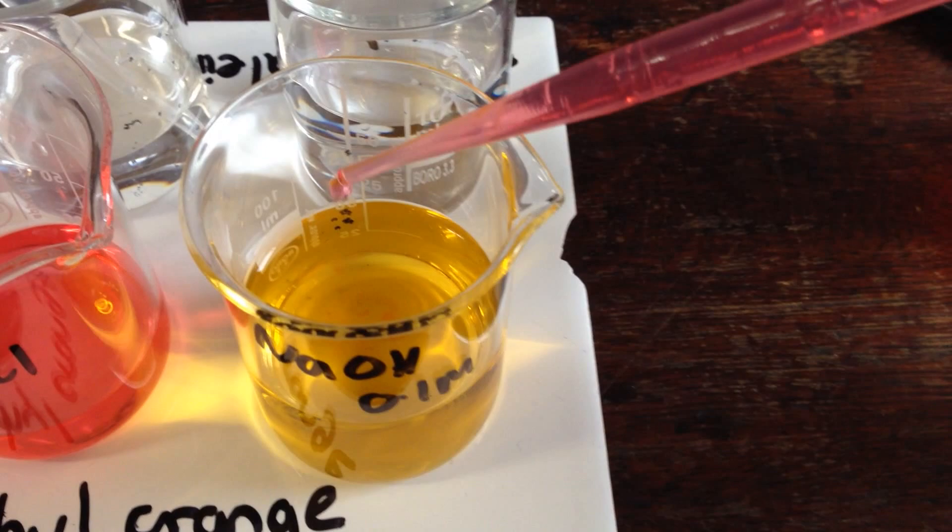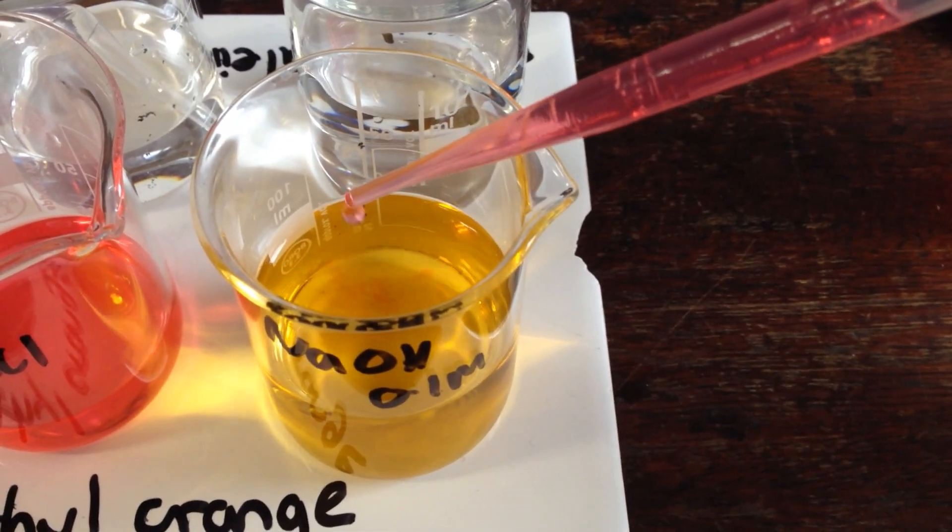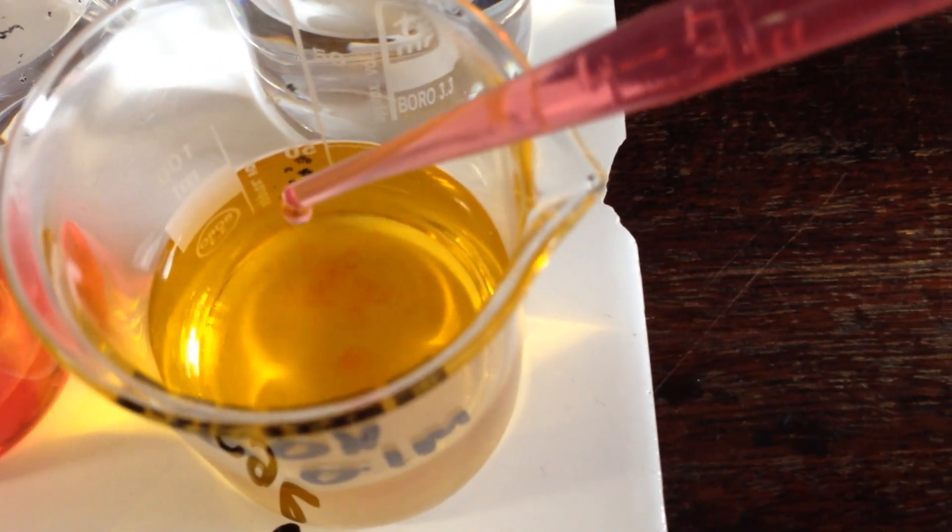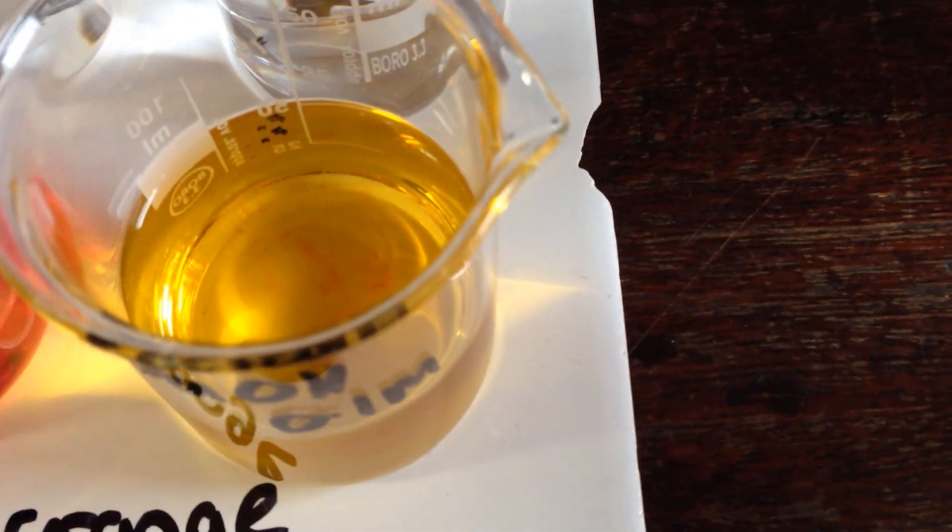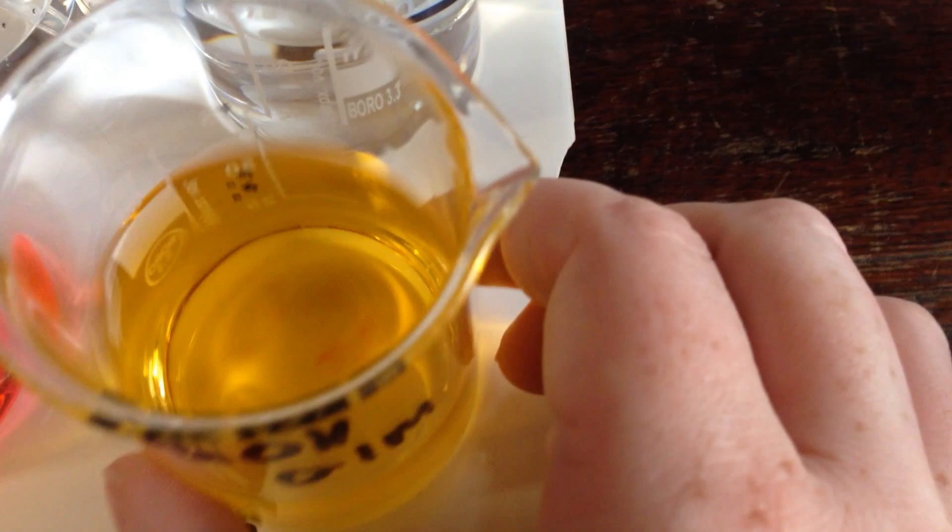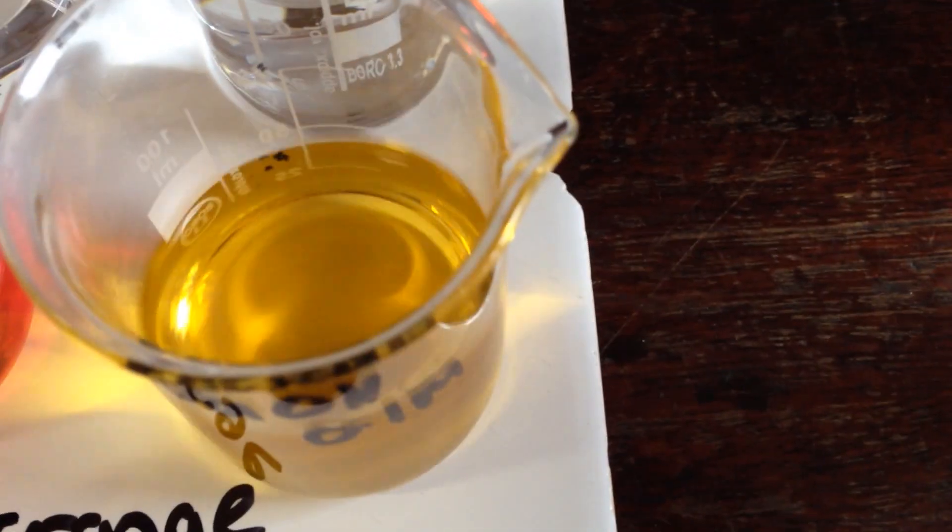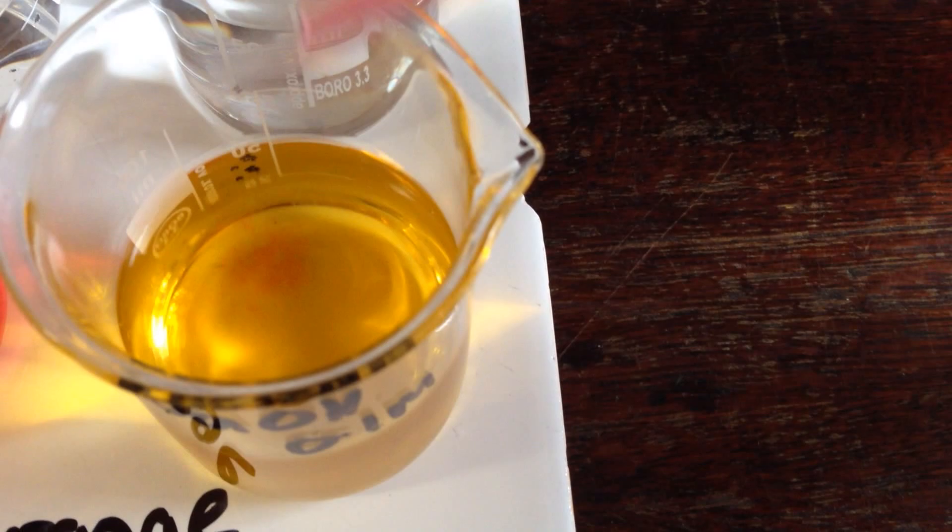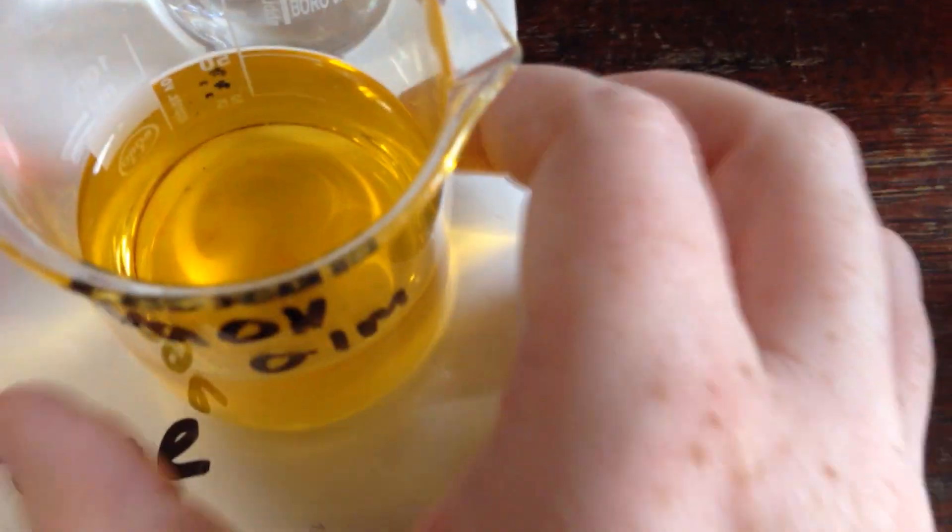The color change for methyl orange is a lot harder because red and yellow are quite similar colors. But hopefully if I go in close, you can see that the drops of red that I'm adding—adding the acid to the alkaline—when I swirl them, they do disappear. Adding in drop by drop, you can see it's starting to get darker.